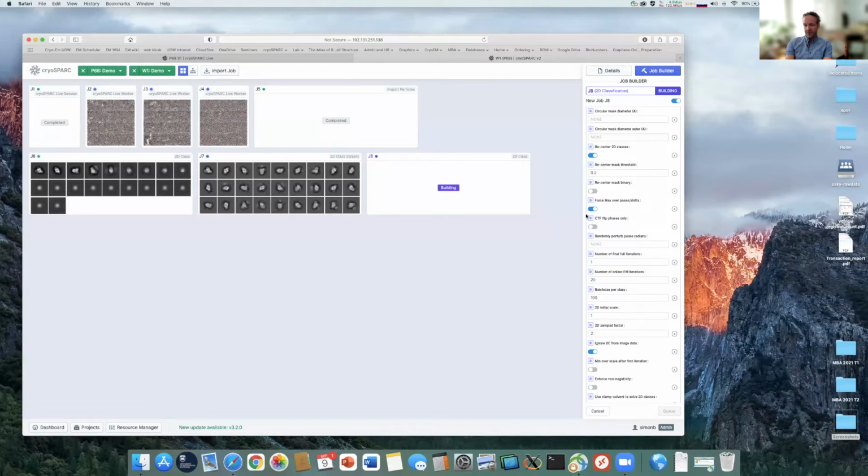My understanding is it's a little bit less certain about classification. It's a lot slower, but it can give quite a bit better results. Also, it's often helpful to increase the number of iterations here. So usually if I turn off force max, I'll double this number of online iterations.